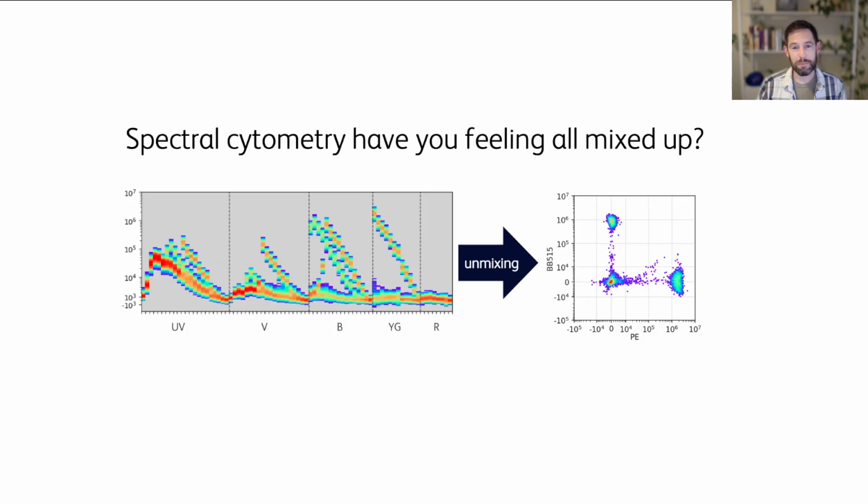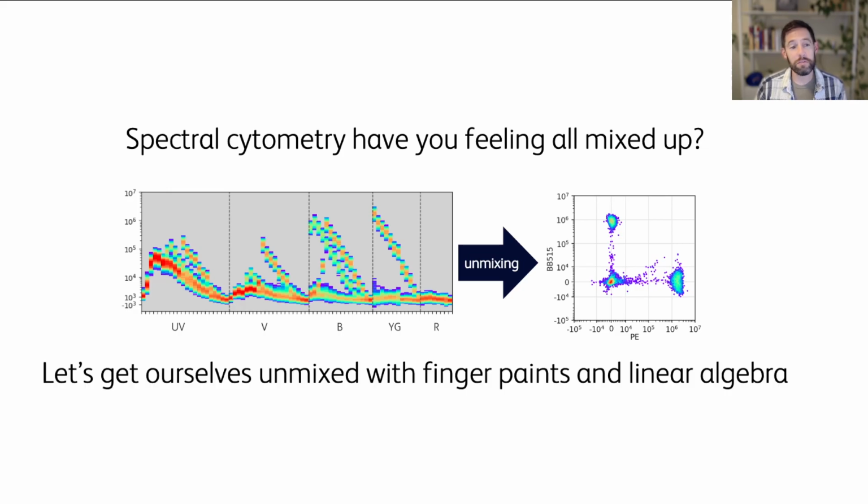If you're feeling a little bit mixed up by spectral cytometry, all these crazy colors and terms and math, well, let's see if we can get ourselves unmixed. And we're going to do that today with finger paints and linear algebra.